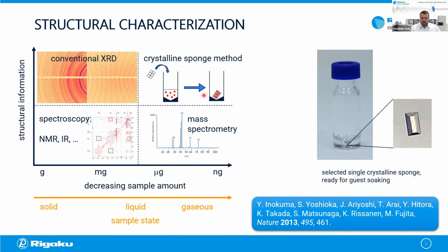Practically, it looks basically identical to the sketch that I just made up here. You have a tiny HPLC vial with a conical shape on the bottom. You load it with a single crystal, some solvent, and your analyte molecule. You let the solvent evaporate, and the analyte molecule of interest goes into the pores.